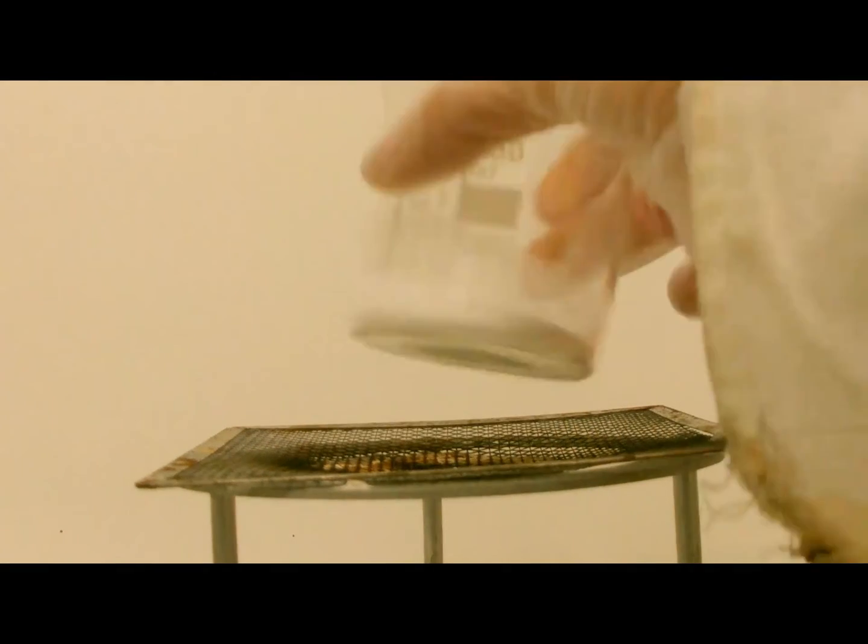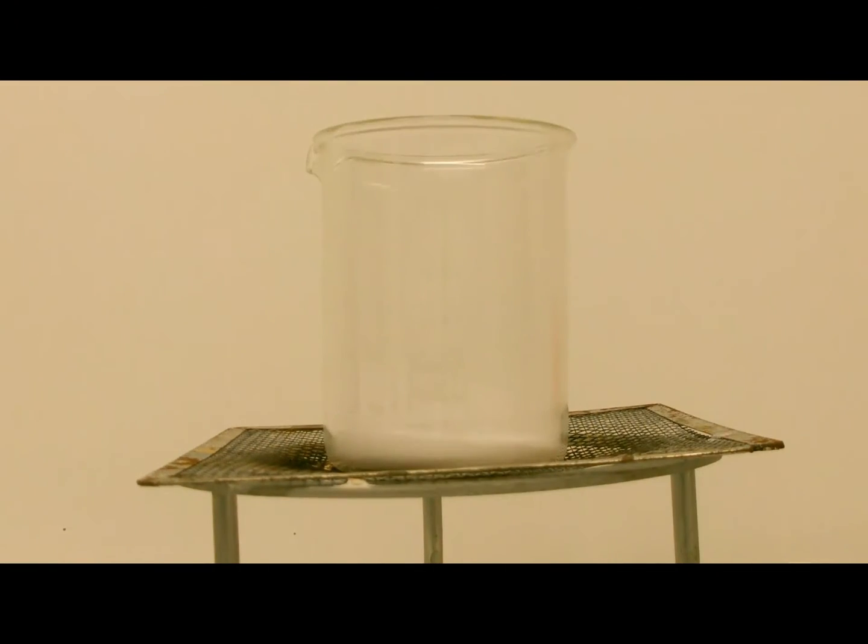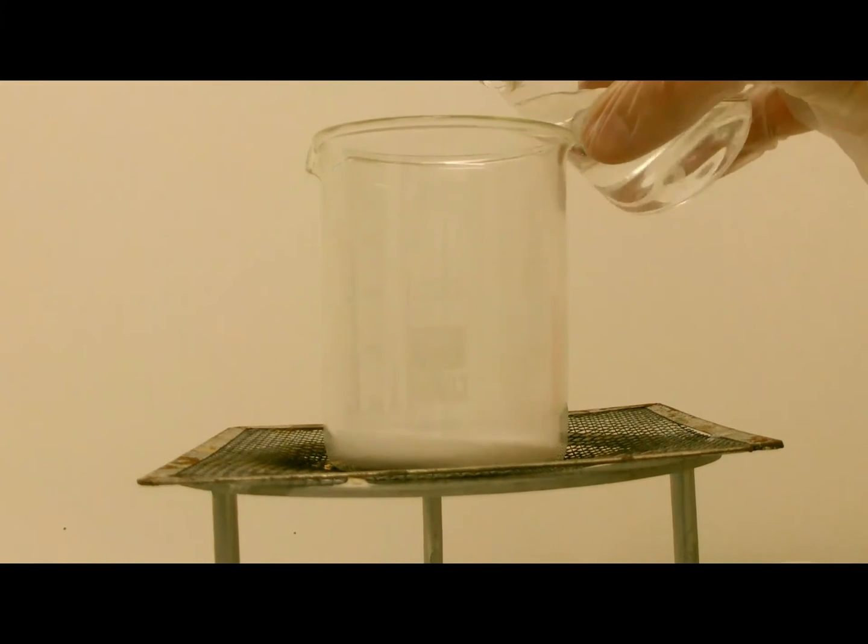So in this beaker we have 2500mg aspirin tablets crushed down to this fine powder, which makes 10g of acetylsalicylic acid, and we will add 50ml of 10% sodium hydroxide solution to it.